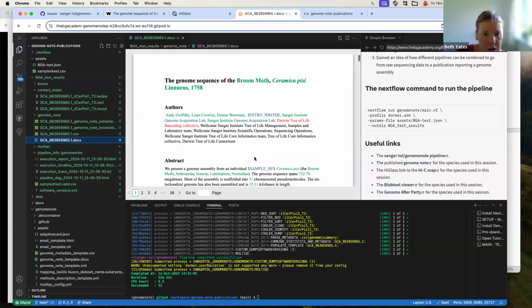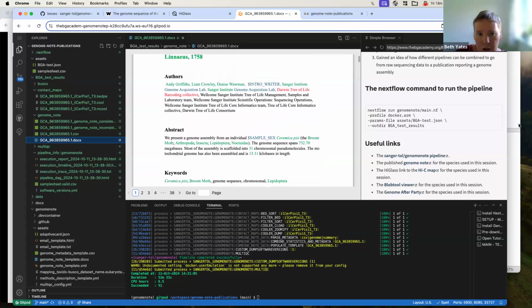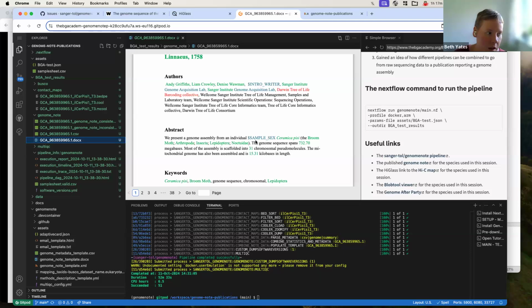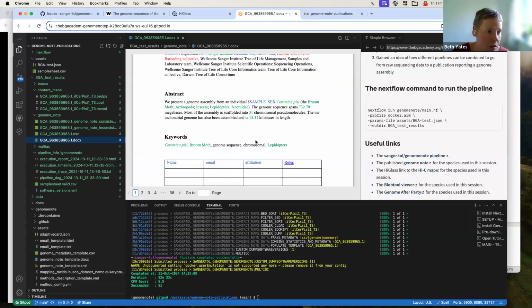That should hopefully match up to what I'm showing you here. But yeah, you can see whether yours is finished or not, it should work eventually. Hopefully that was useful and gives you an idea of what we're working on.